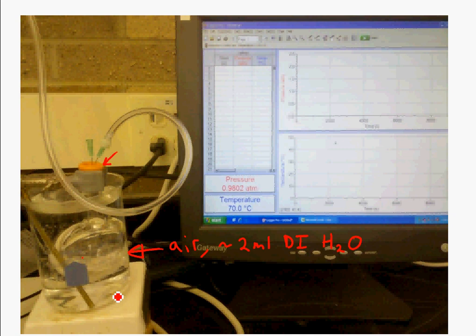And as you can see, in the hot water bath there's a stir bar. This is a stir plate. And notice that we have a temperature probe in there, and the current temperature is 70 degrees Celsius. So we've heated up the water with our distilled water inside. Connected through the septum, you see that we have 2 different needles. We have one needle connected to our pressure sensor that measures the total pressure, which at this point is 0.9802 atmospheres, because it's reading it. And then we also have this other needle that's stuck in there.